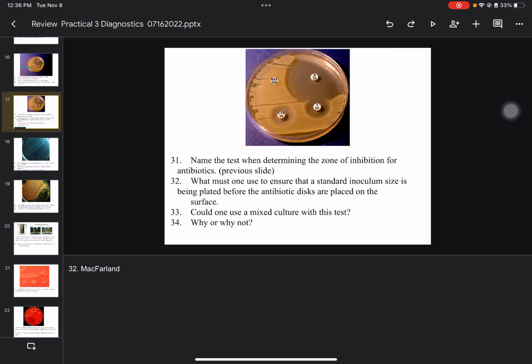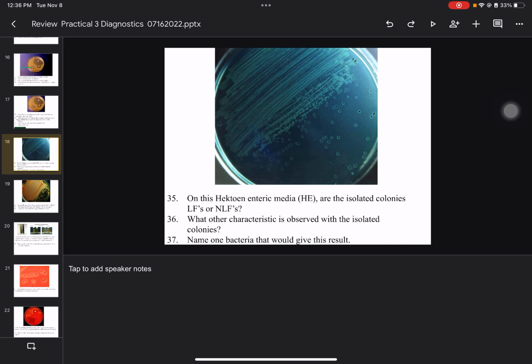How that happens. Okay? This is Hektoen enteric agar. What's the pH indicator in Hektoen enteric agar? Bromothymol blue. What is the presence/absence indicator for hydrogen sulfide production? Is it the black center? Which one? Iron. Okay. I mean, you could say ferrous ammonium citrate, but iron is okay.